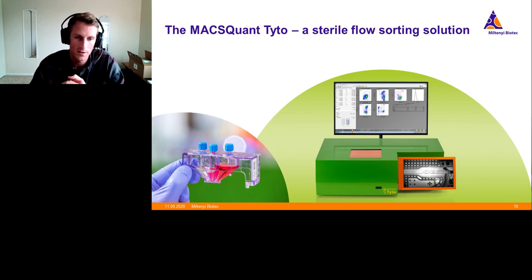So once the cells are placed into the cartridge, they are then dropped into the cell sorting device, the Tyto. This is a benchtop instrument. It's really quite a small footprint compared to an enormous biosafety cabinet with a sorter inside of it with the fluidics that are attached. There's no onboard fluidics. The only liquid is really what you see in the cartridge on the left side there. The system's microfluidic based, and it will use 3 lasers and up to 8 colors to differentiate cells into subpopulations that you may find of interest.